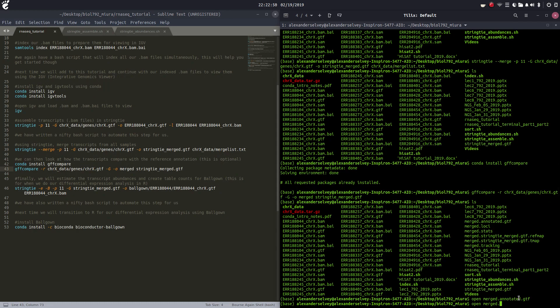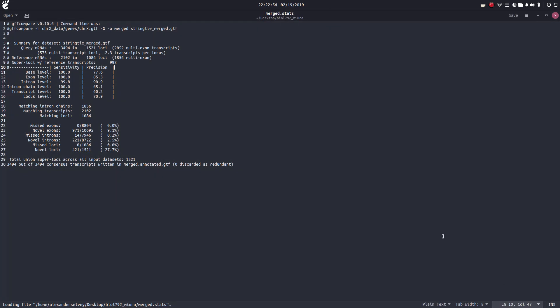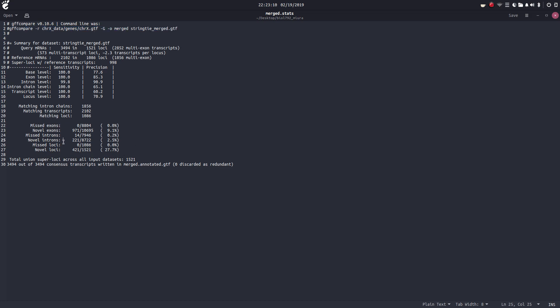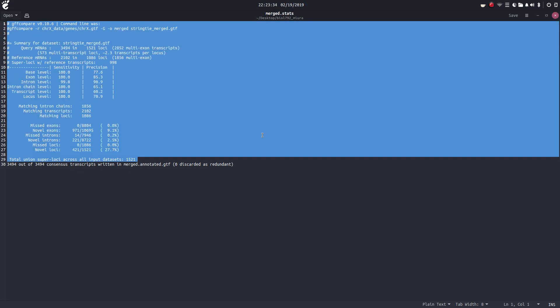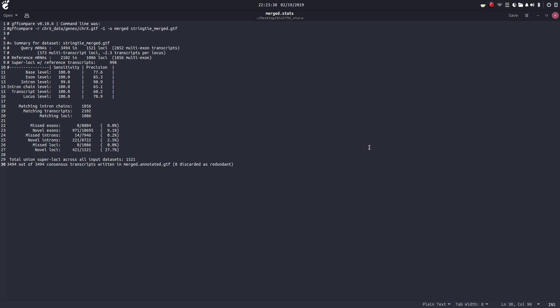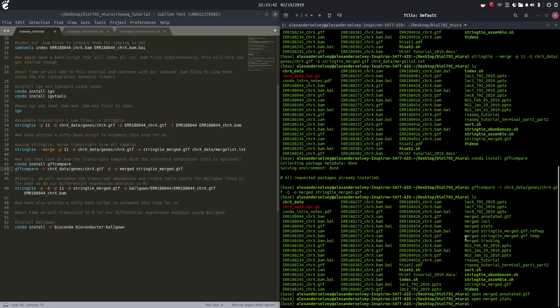Now we're going to open our merged.stats file. This kind of summarizes our command - what did we get, what was our output. We have all of these levels of sensitivity and precision, as well as whether we missed exons, have novel introns, missed loci. Query mRNAs: we have almost 3,500 corresponding to 1,500 loci. Our reference mRNAs: there's about 2,000 corresponding to about 1,100 loci. This is a really good summary file.